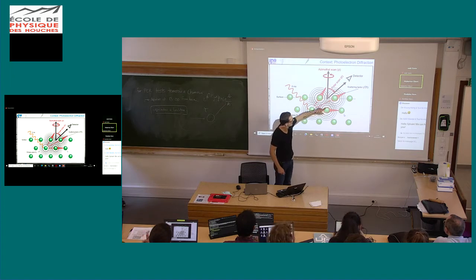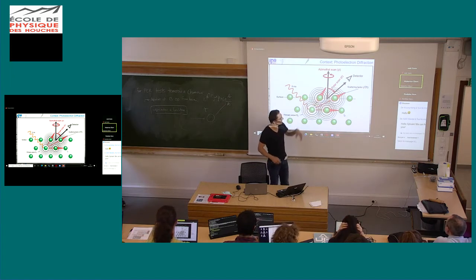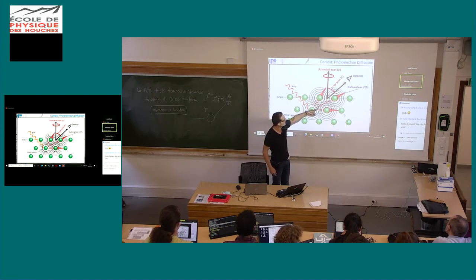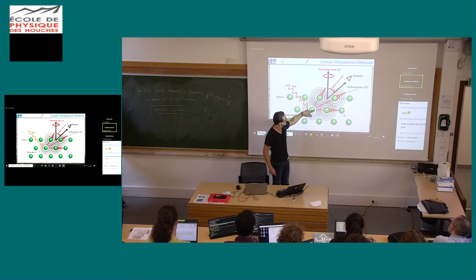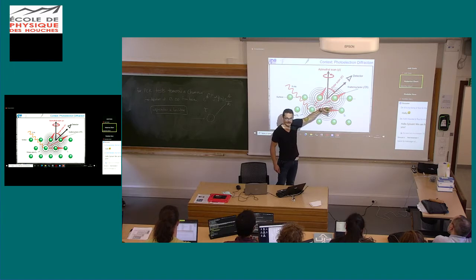A property that is really interesting, which Didier talked about during the last presentation, is the scattering factor, which is represented here. Basically, the scattering factor is how the photoelectron intensity is redistributed after the scattering event. And when you are using a photoelectron in the hundreds of electron volt or kilo electron volt range, the shape of this scattering factor is like this. So this is strongly forward peaked.